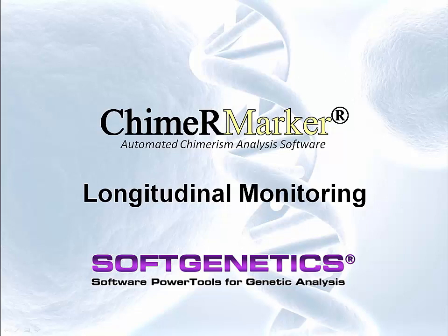Today I'm going to be talking about longitudinal monitoring using ChimerMarker software. Now, this is an advanced topic in ChimerMarker, so if you haven't watched the ChimerMarker introductory webinar yet, I encourage you to first go back and watch that webinar and then proceed with this webinar.